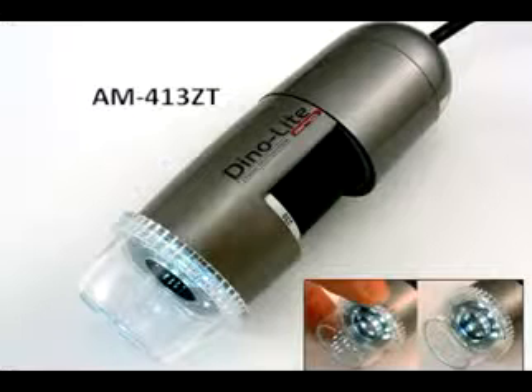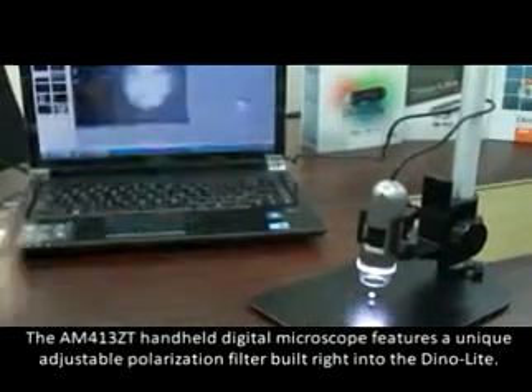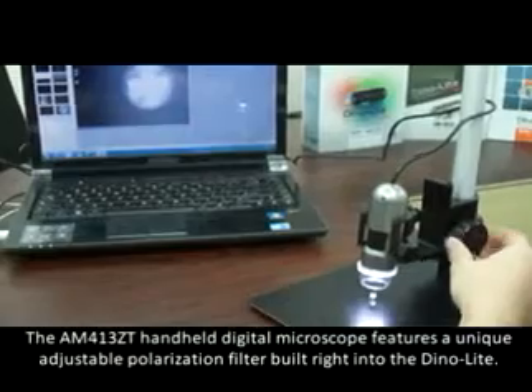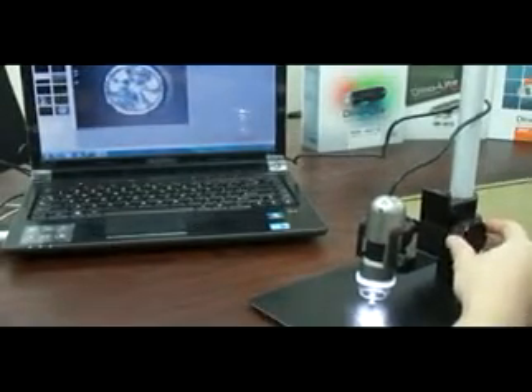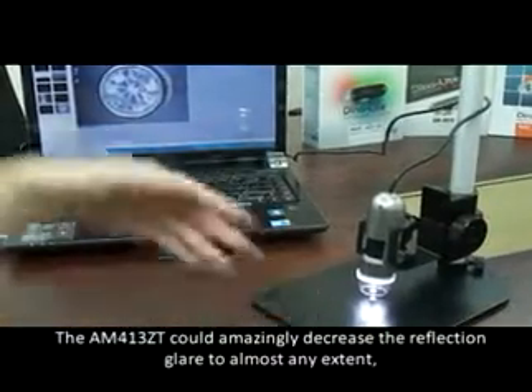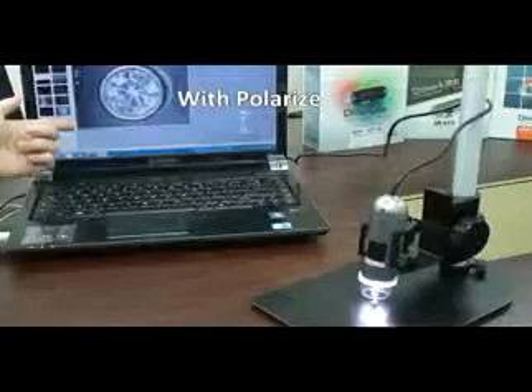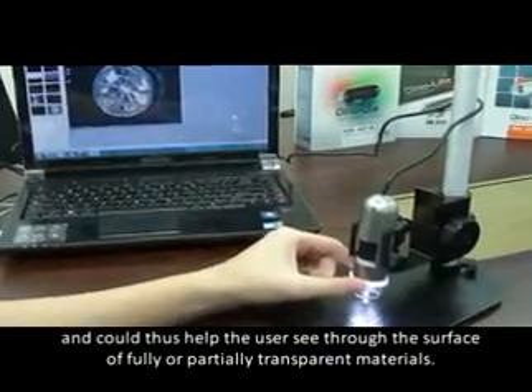The AM413T handheld digital microscope features a unique adjustable polarization filter built right into the DinoLite. It can amazingly decrease reflection glare to almost any extent, and can thus help the user see through the surface of fully or partially transparent or reflective materials.